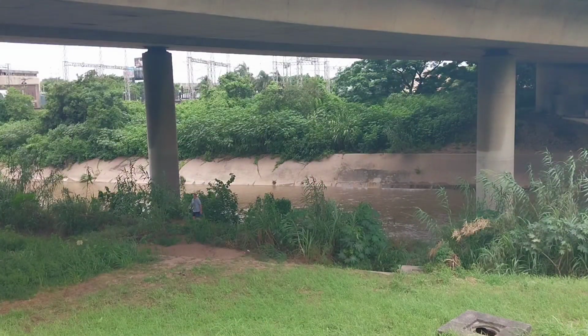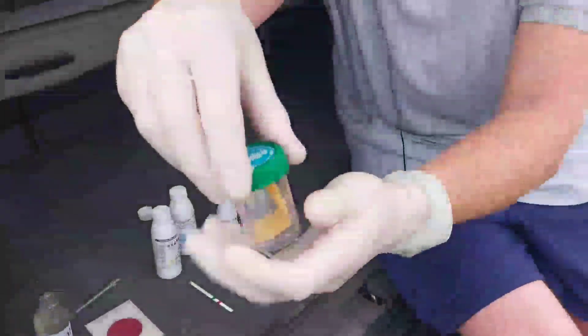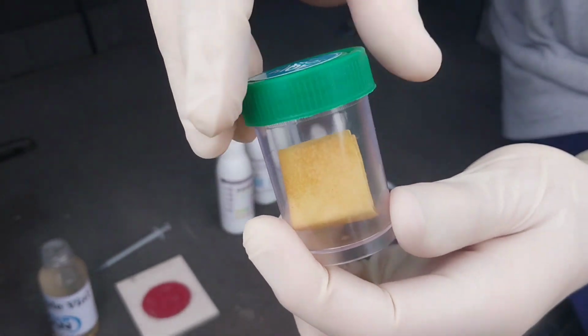I get my syringe, take my water in, just make sure there's no air in here. Okay, and then I'm going to take the water out as much as I can. Okay, we're going to just pull back this little screen. I'm going to pump this water in nice and evenly all along here. Okay, and then I'm going to slowly push this down and help it spread. And then this one has got a little piece of paper in here that obviously does the test.